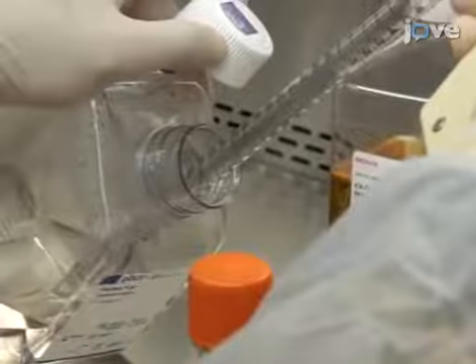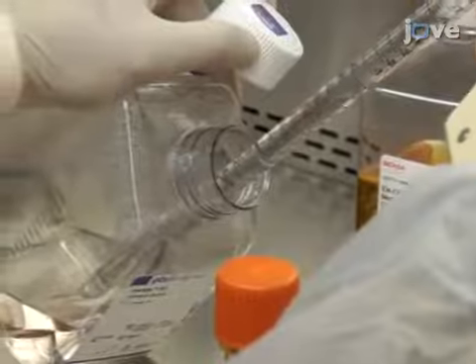Prepare fresh culture medium for a 30 milliliter culture by withdrawing 26 milliliters of medium A.